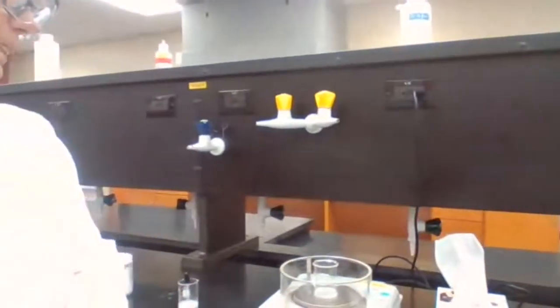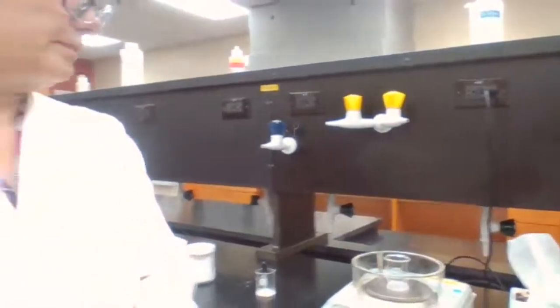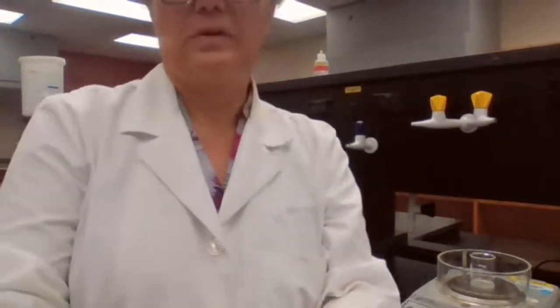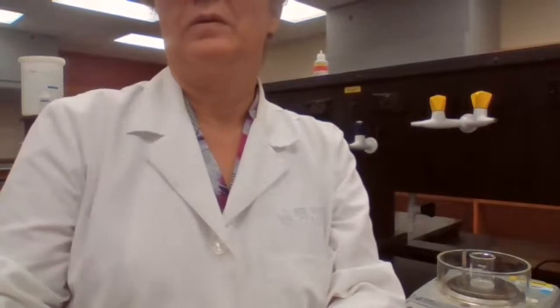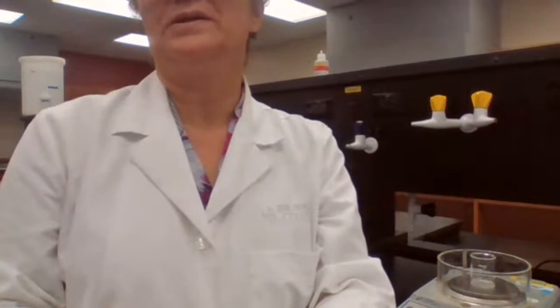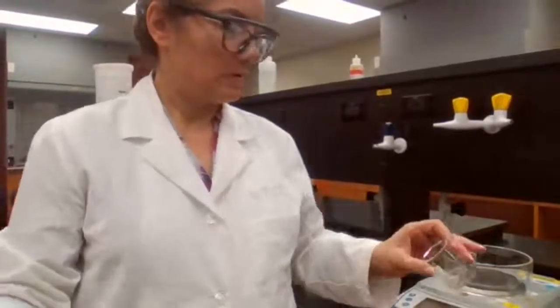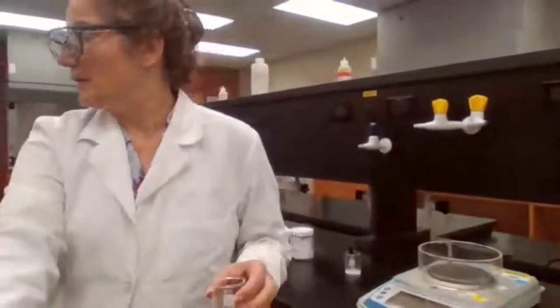Okay. The mass is 31.47. So this is the mass of the beaker plus sample. You can find the mass of the product.